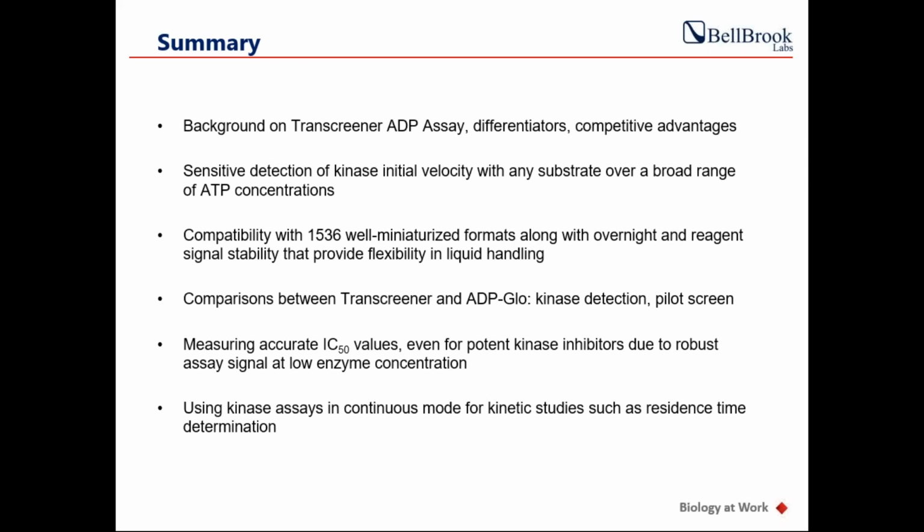And then show you how some of the differences in the assays in terms of our sensitivity enables us to obtain accurate IC50 values, even for very potent kinase inhibitors. And last, I'll show a few slides on using the assay in kinetic mode, which is really a nice thing to be able to do, because it enables you to get things like drug residence time, which are really becoming a key factor now in lead optimization.